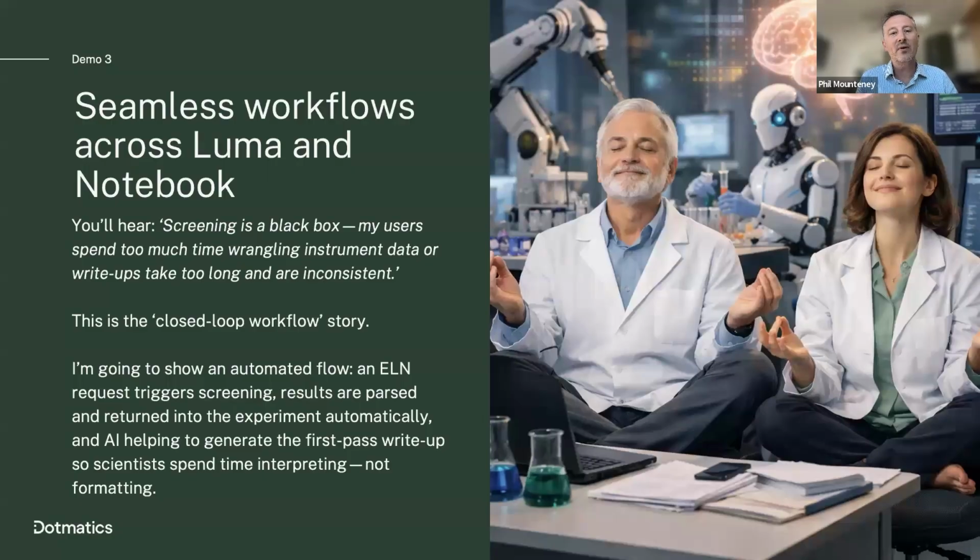The third demo. So how can we actually build seamless workflows across here? So not just share data, but actually build a workflow. And I've got two examples for you. My first one is to actually use a screening system and build an automated analysis system. So instead of having to manually handle raw data files from your instruments, allow Luma to collect and harmonize all of that data, and then using the APIs that we have in our screening system in our notebook to create a screening experiment. And then the last one, I'll actually come back to that very first chemistry experiment where I'll show you how we can use Luma's agent to go and help us do things like write up and summarize these ELN experiments.